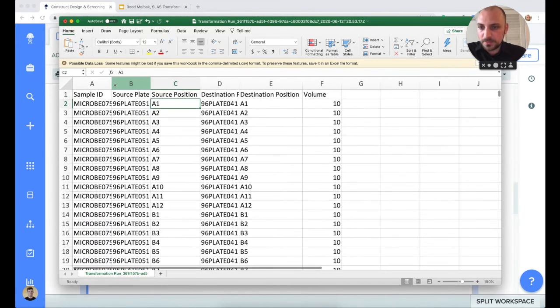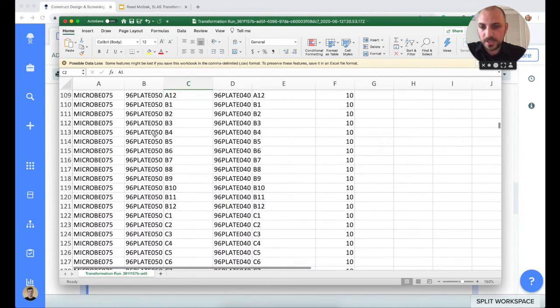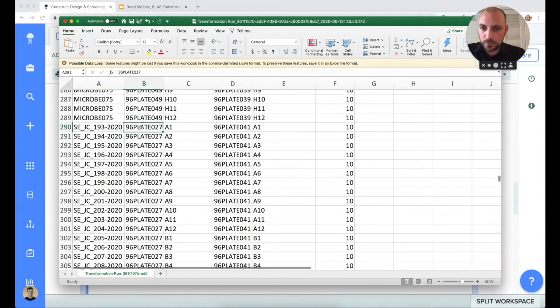And as you can see, we have this twice. We have this for all of the strains that we were using. This is that plate, 3 sets of strain plates. And then finally, we also have all of the different vectors, one per well. So these are the instructions.